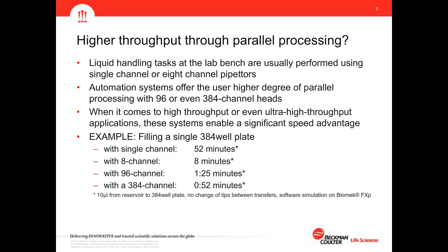You can actually see here that at the 384 channel head usage, most of the time is not the actual pipetting, because the difference between the 96 and the 384 is so small. Most of the time is used for loading the tips, actually, because this scenario is done with disposable tips. So if you have multiples of these plates instead of filling a single one, the advantage would be even much more significant.